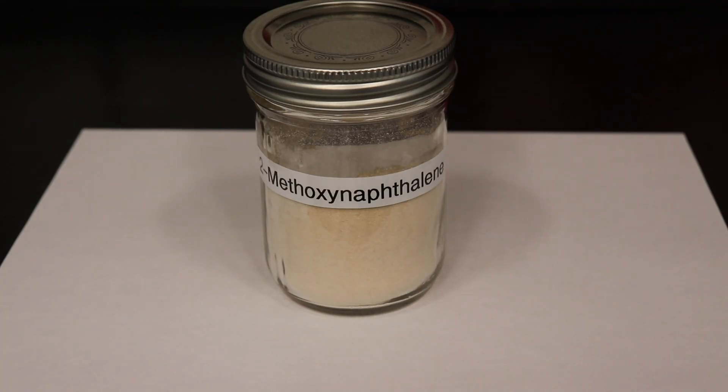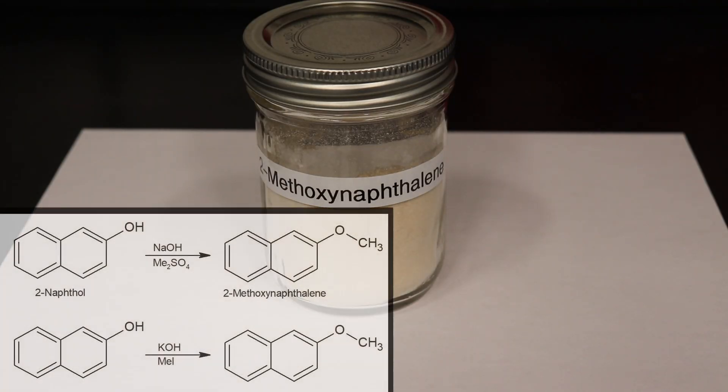Today, I will be demonstrating two methods for the methylation of 2-napthol to form 2-methoxynaphthalene, one using dimethyl sulfate and another with methyl iodide.